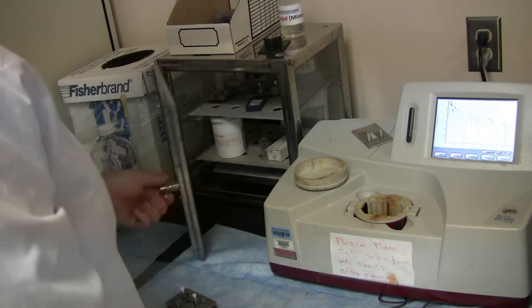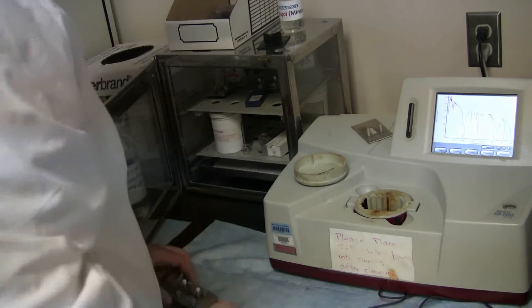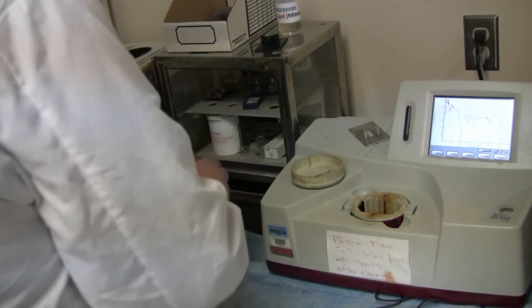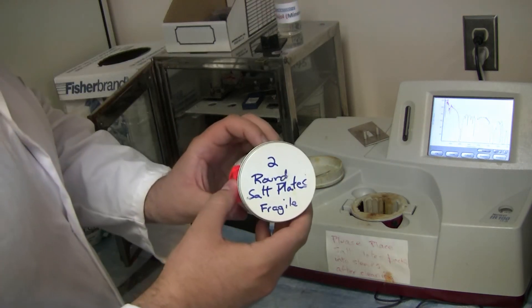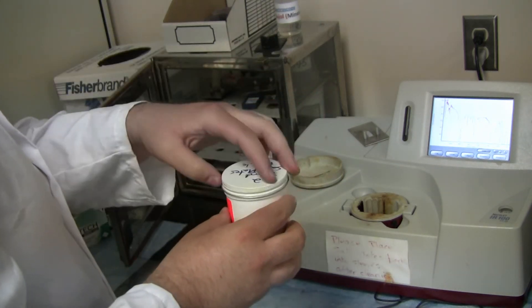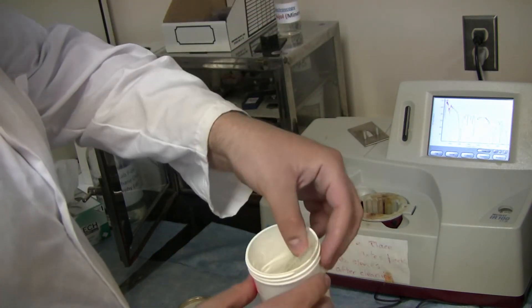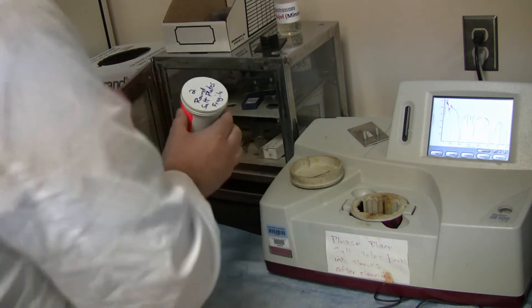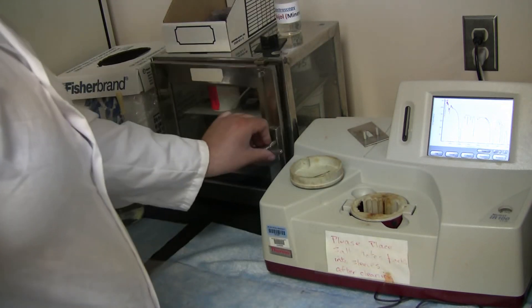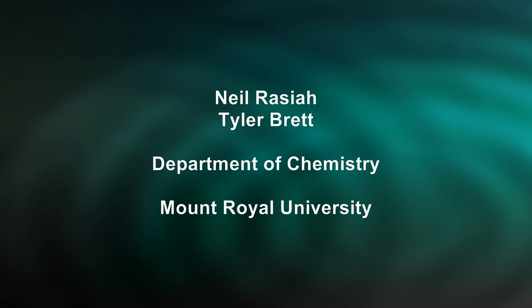When finished using the equipment, make sure it is thoroughly cleaned, and then place it into the desiccator. The desiccator removes moisture from the air and prevents it from building up onto this delicate equipment. When finished with the salt plates, place them back into this container. Make sure to screw on the lid and place it back on the shelf. Make sure to lock the desiccator.